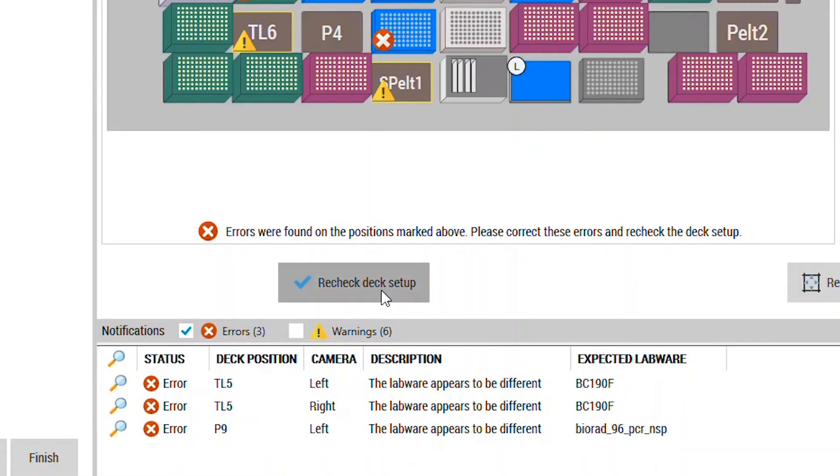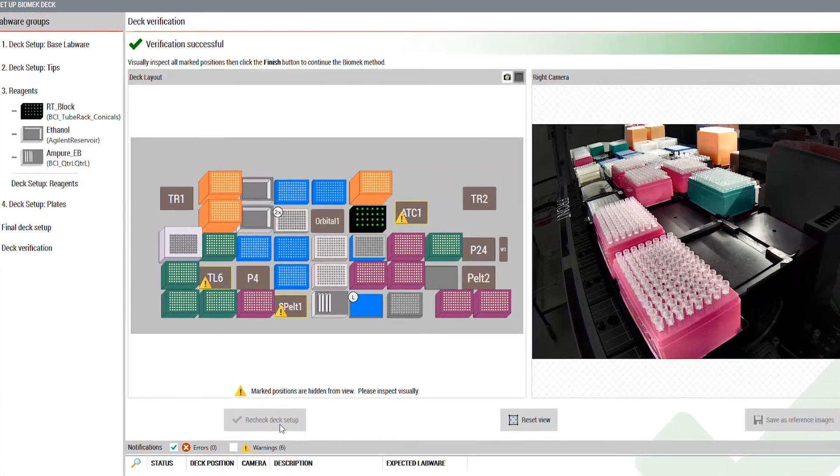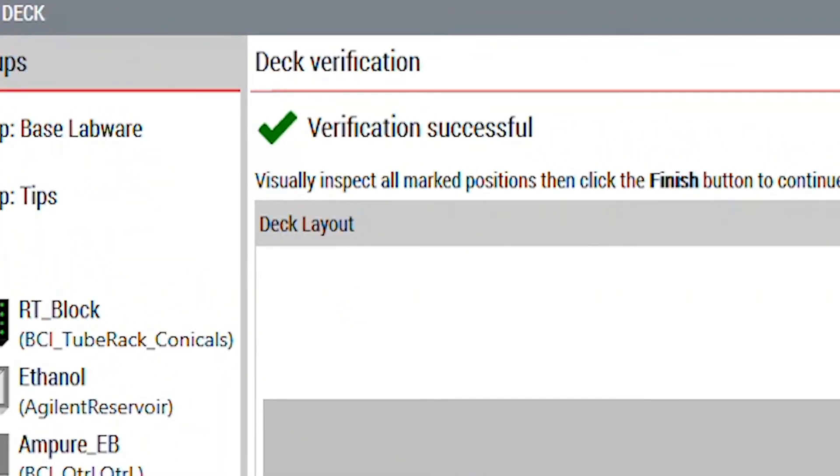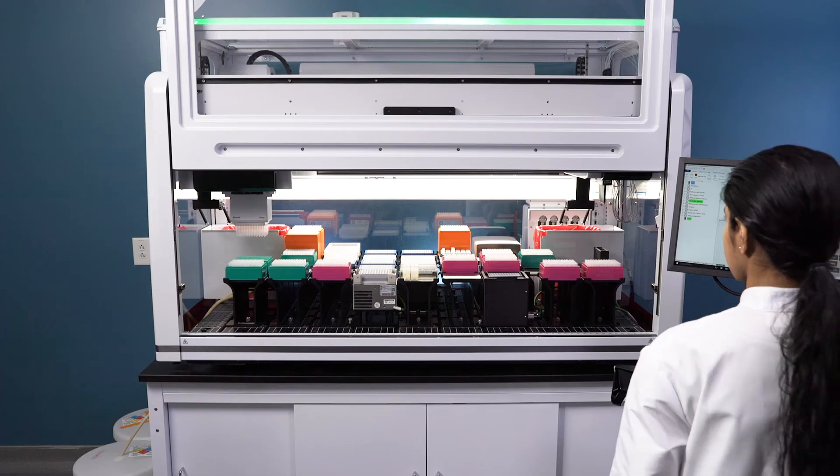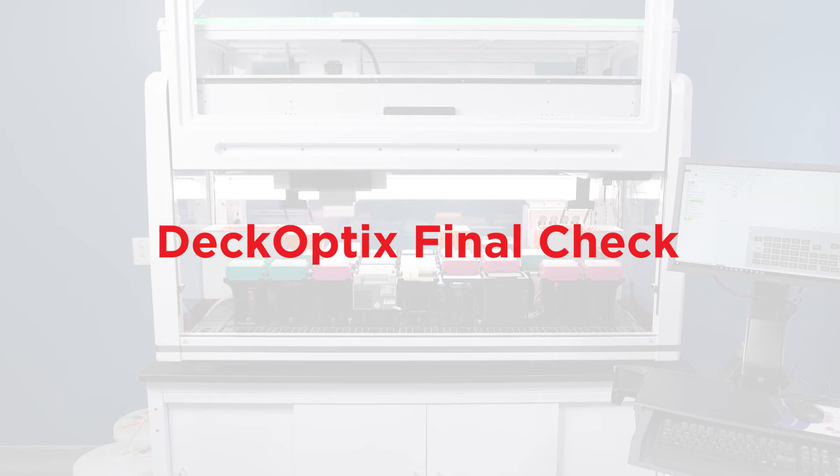Want to maximize lab efficiency by avoiding unplanned method interruptions? Want to protect your valuable samples? Use DeckOptics' Final Check software with your Biomek liquid handler to detect problems before you start.